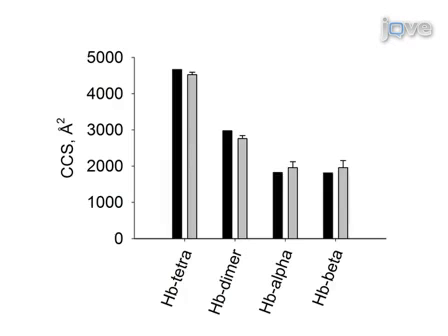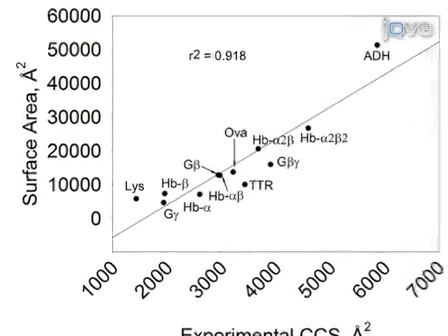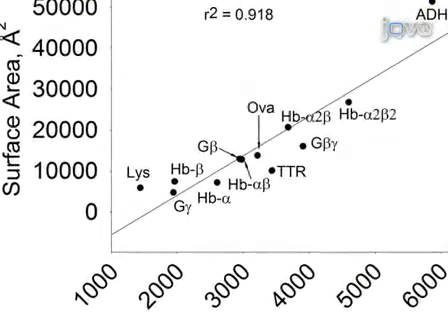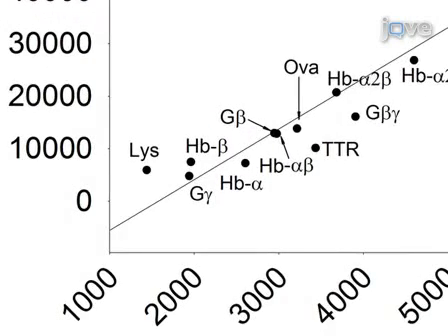Given that a tetrameric complex has 3 possibilities of association, either cyclic, dihedral, or chain-like packings, by calculating the increase in omega when moving from a dimer to a tetramer, the structural organization can be predicted. Previous studies and our own experiments have shown strong correlation between measured CCSs and protein surface areas derived from crystal structure data. This correlation can be used to calculate the expected increase in surface area of a tetramer compared to a dimer for the different packing forms. This is done by considering each subunit as a spheric object.